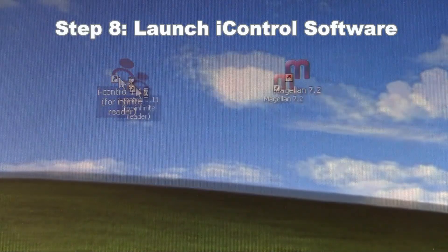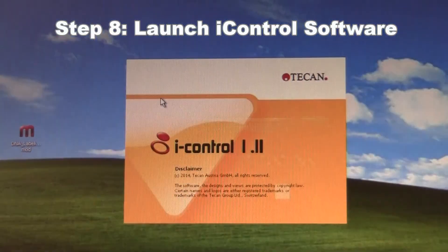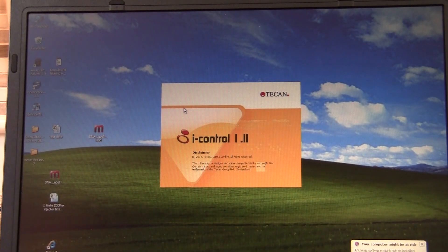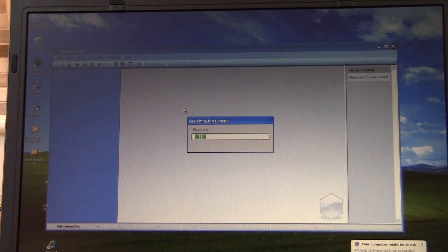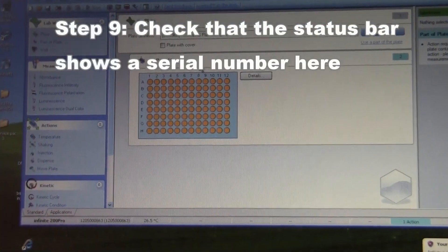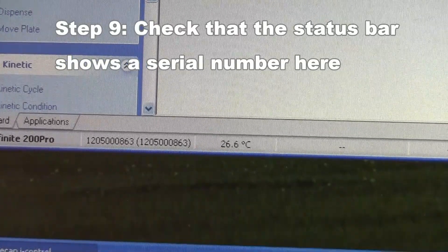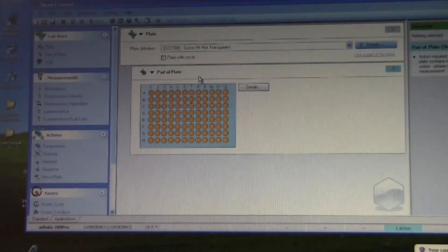Then go to the computer and launch iControl software. The software will run through a routine where it connects the computer to the reader. When it successfully connects, you will see the serial number for the instrument listed in the status bar for iControl software. You will also be able to use the icons from the menu to move the plate carrier in and out. At this point you're ready to begin taking measurements.